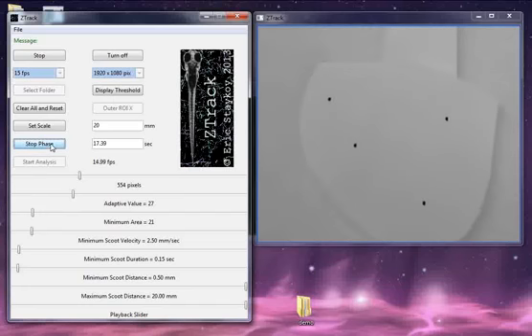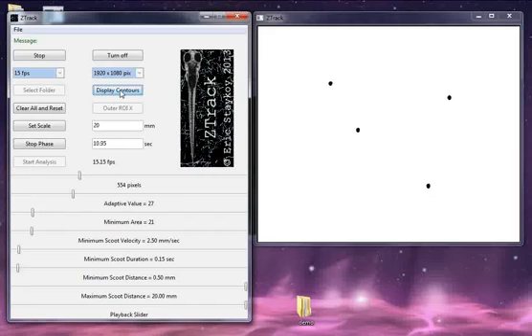I'm going to press start next phase, and this will start the recording. I'm moving the paddle around, and you can change the views to say threshold or contours while the recording is happening, and it'll finish up in about 4 seconds. Okay, it's done.